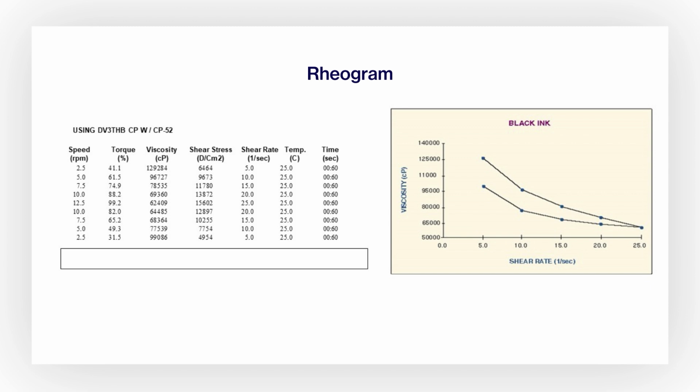Let's look at the starting and ending torque values. There is almost a 10% difference in torque. Hysteresis has occurred during this test with a significant loss in viscosity over the duration of the test. This may indicate time-dependent thixotropic behavior. Again, this may be the result of time or breakdown of the fluid from shear. In either case, pseudoplastic behavior was observed.